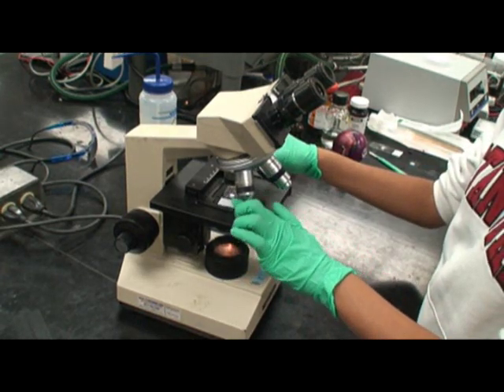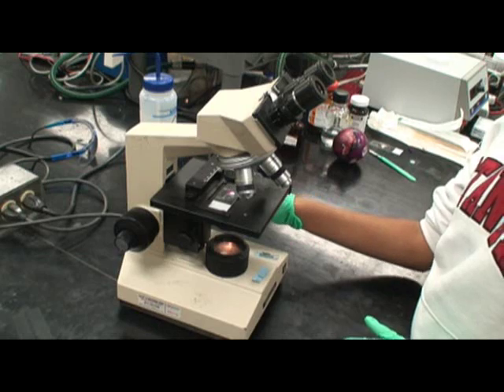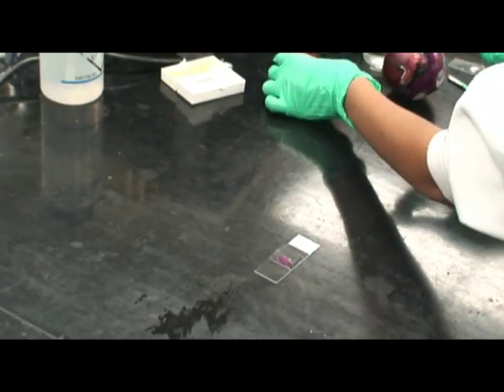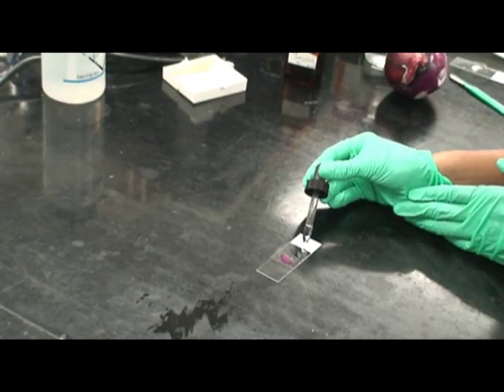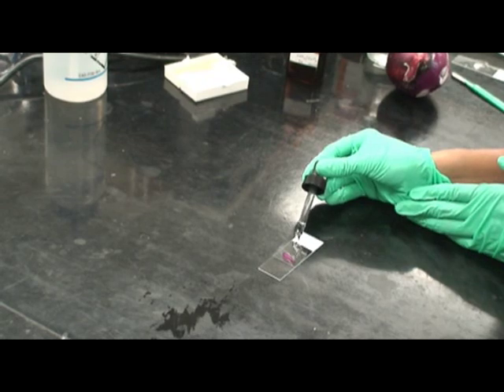Examine under low then medium magnification until you find an area where you can clearly see individual pigmented cells. Draw a drop of plasmolysis solution under the cover slip while observing the onion cells under the scope.